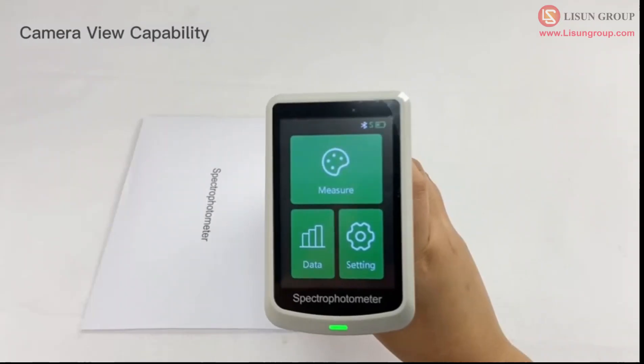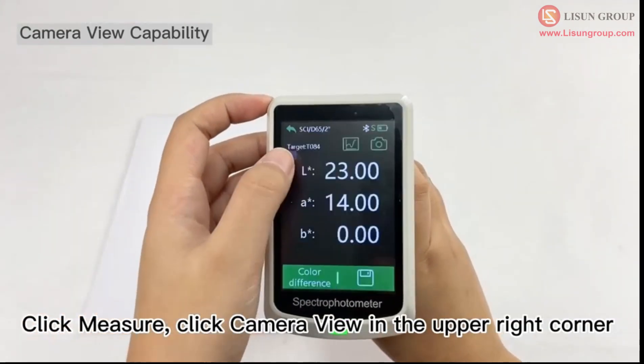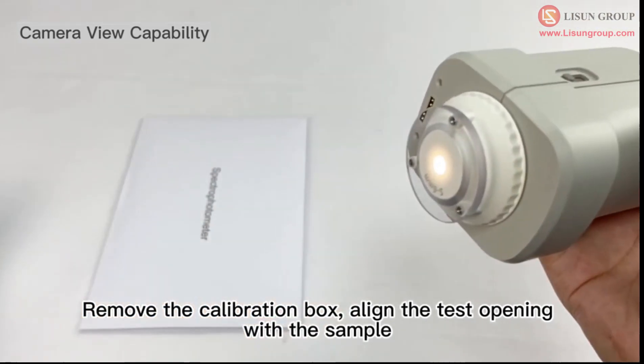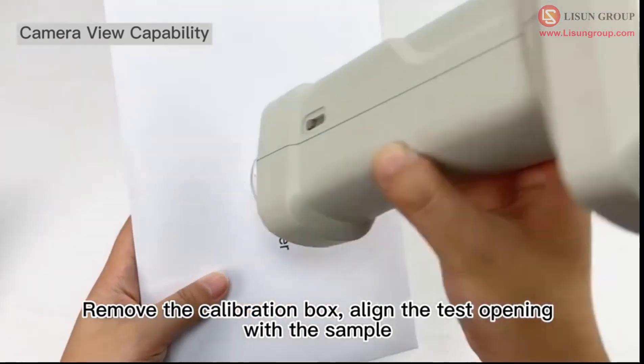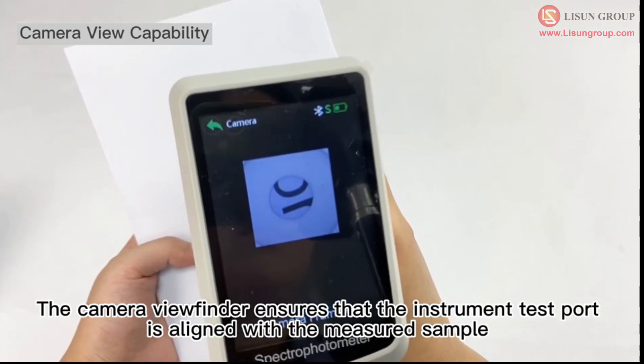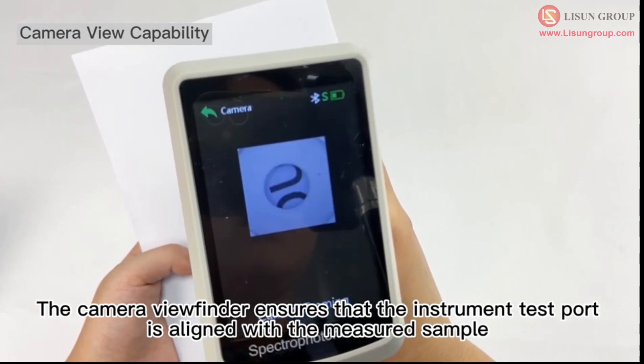Introduction of other functions. Click measure, then click camera view in the upper right corner. Remove the calibration box and align the test opening with the sample. The camera viewfinder ensures that the instrument test port is aligned with the measured sample.